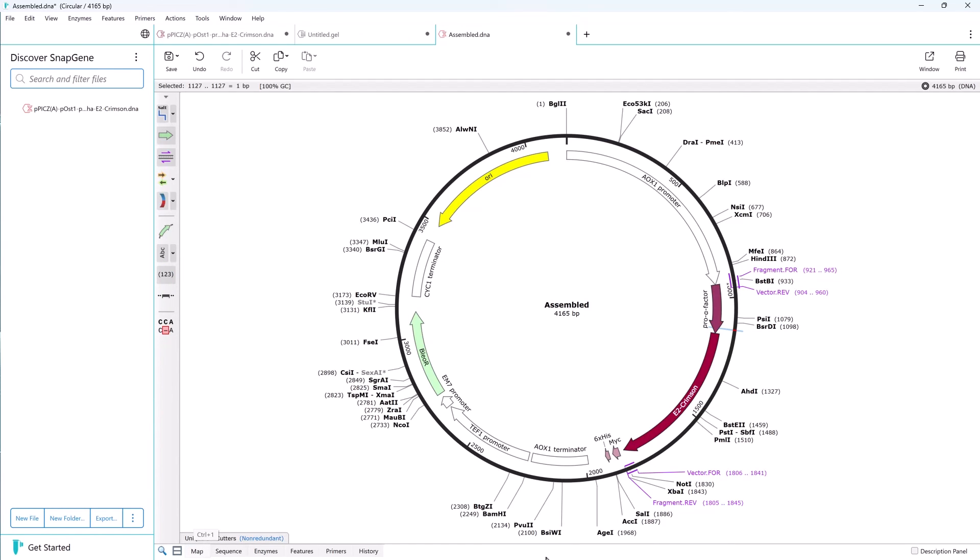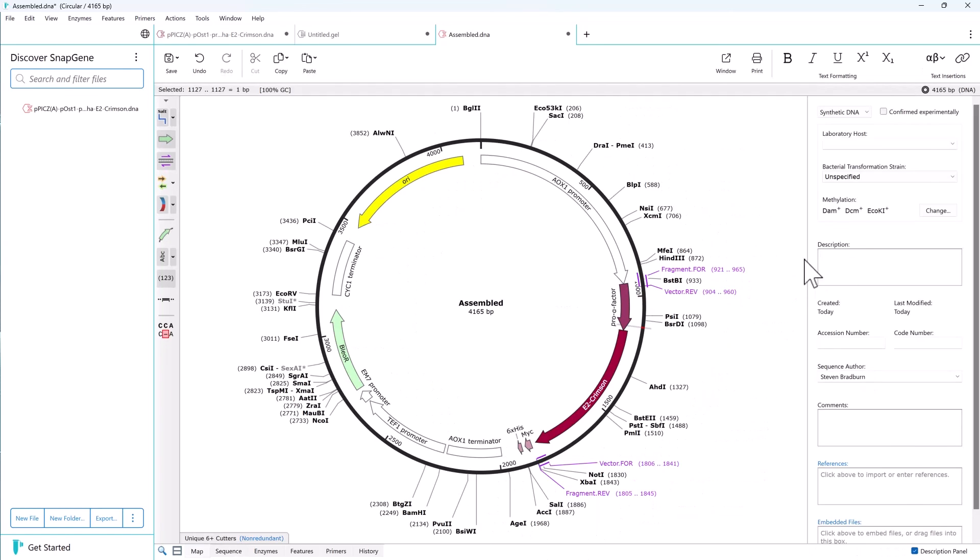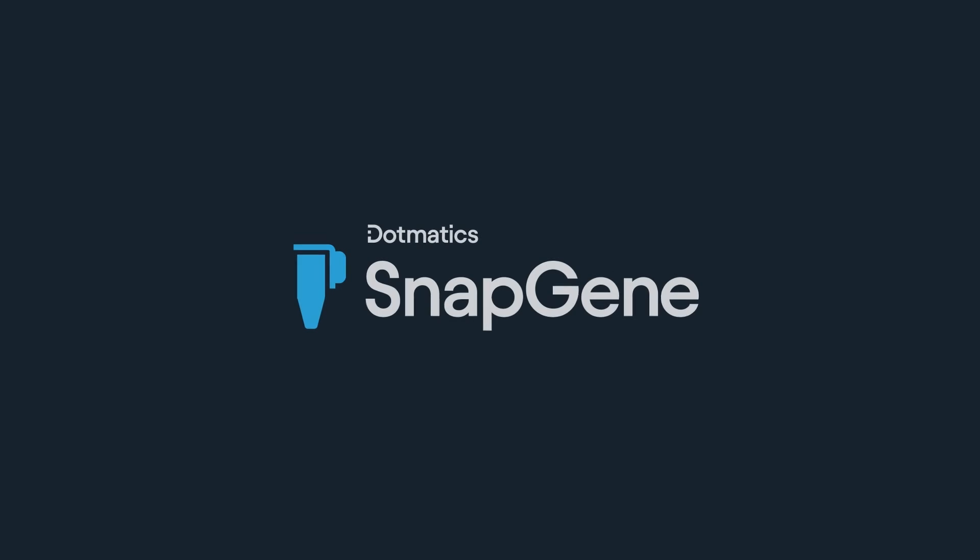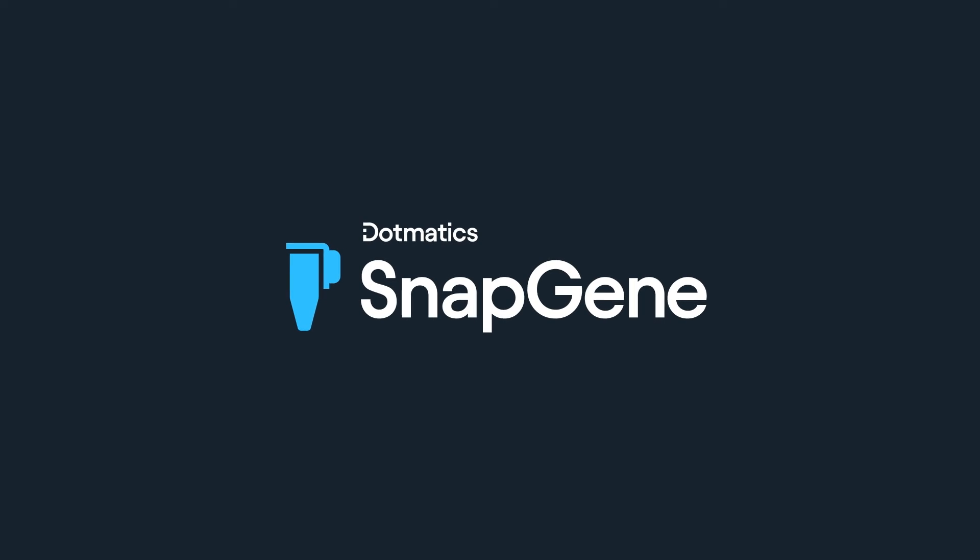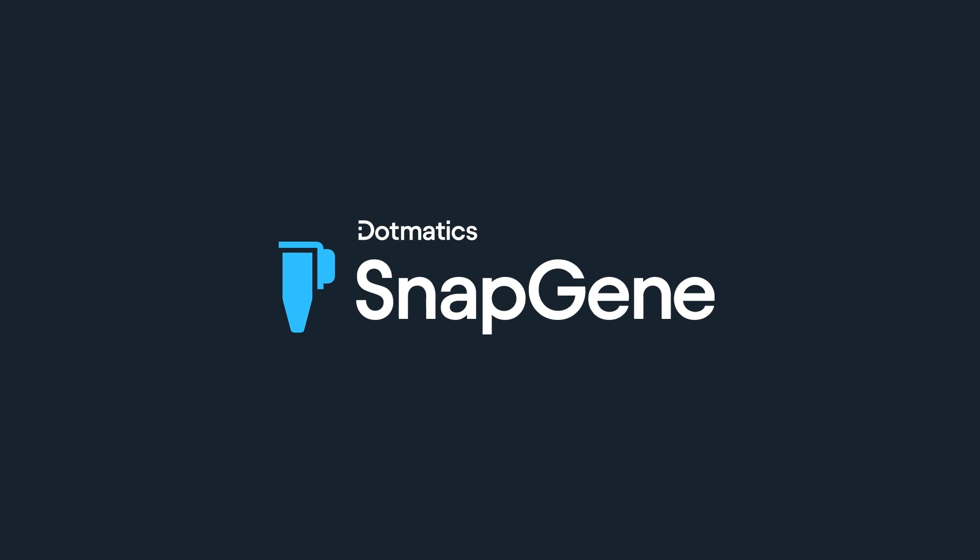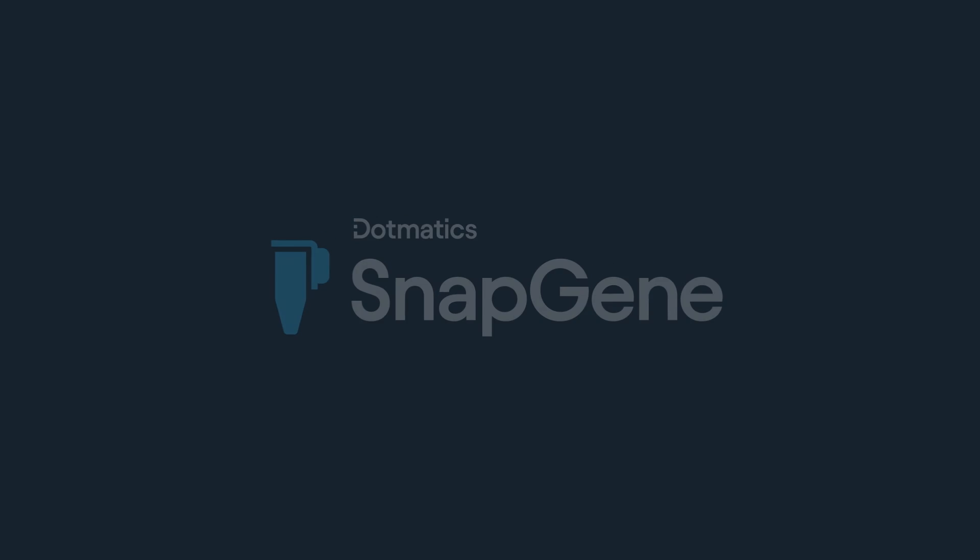The description panel allows you to add notes and other information. And that's a short demonstration of how SnapGene can improve your core molecular biology procedures and results. Visit snapgene.com to sign up for your 30-day free trial.